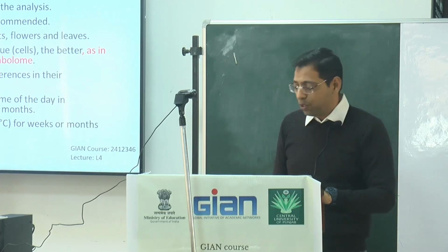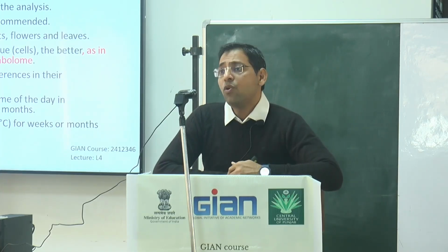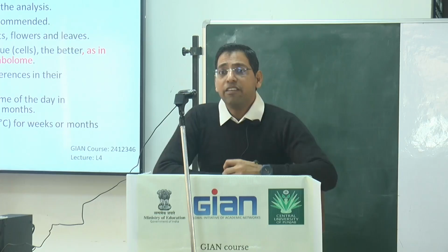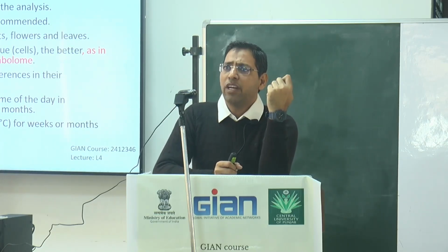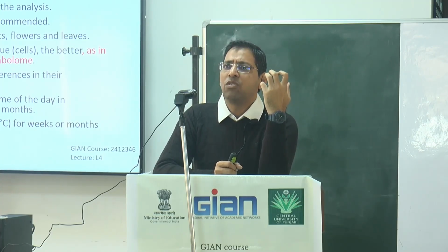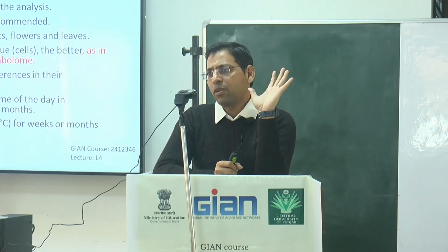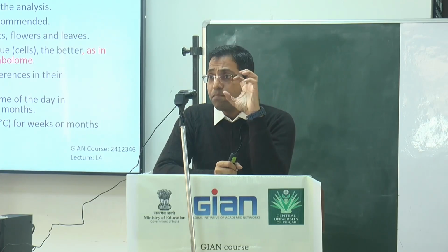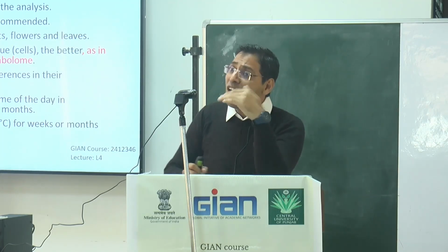Harvesting time, as I told you. You have to take care of fresh materials. What is the meaning of fresh materials? When you take the leaves, roots, and stems and put them in a bag, and after 24 hours you want to do the metabolomics, sorry to say, your sample is already destroyed. The metabolites of any cell change every second.